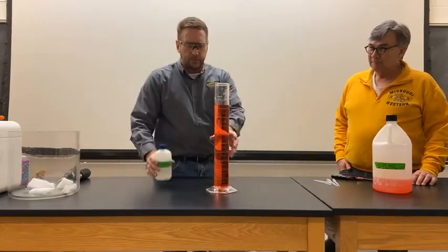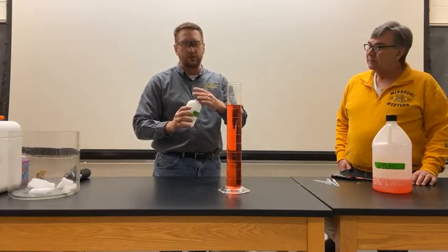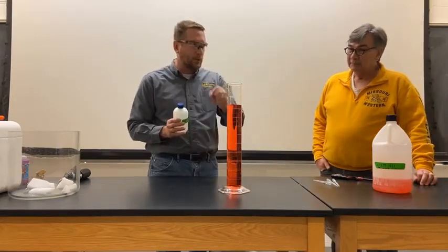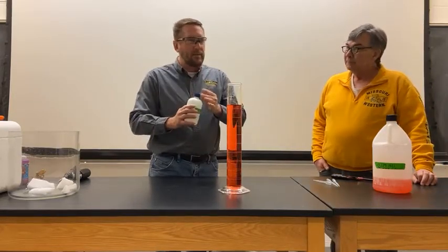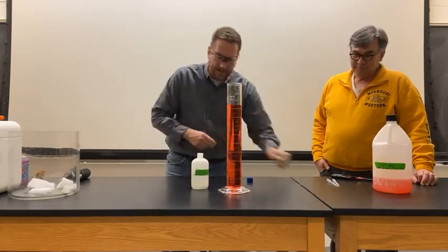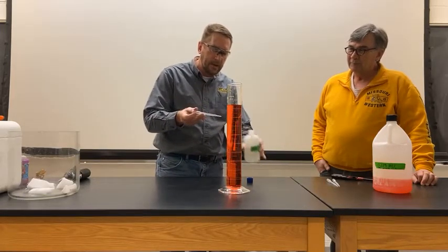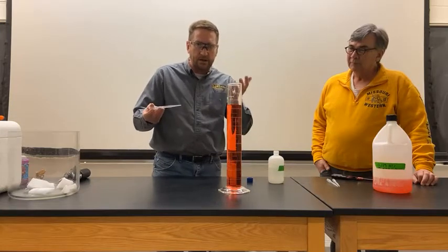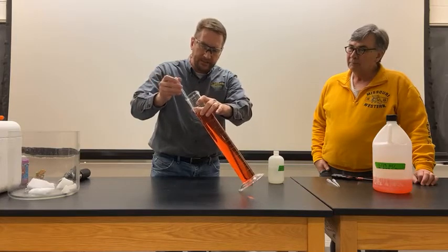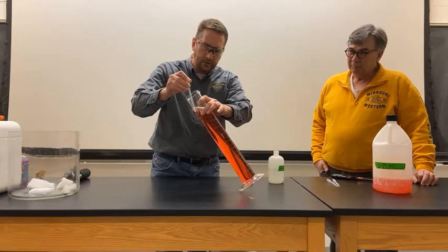Now, one of the things you might wonder is, how do I know it's basic? Well, if you've ever put some sodium carbonate on your fingers, it feels slippery. Those slippery things, they tend to be bases. That's a pretty good clue that it's a base. So what we're going to do is I'm going to take this saturated sodium carbonate, and it's saturated on purpose because I wanted it to have a really high density so that when we put it into this container, it goes straight down to the bottom.